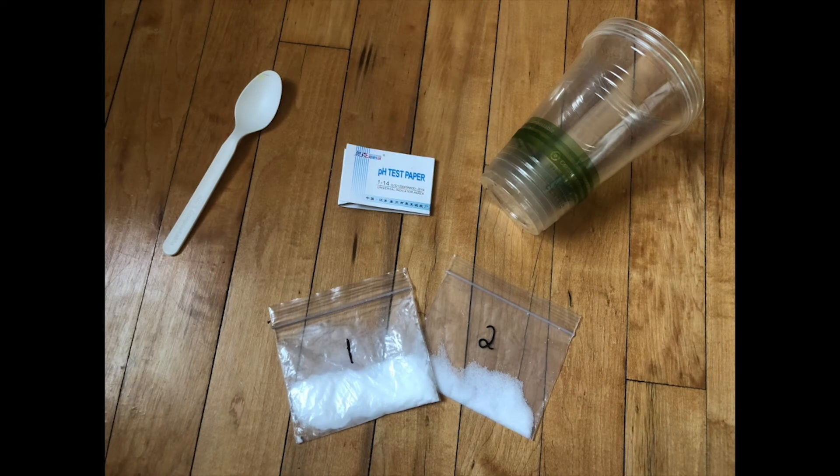The pH of a body of water can have a huge impact on the life that can live there. So let's get started taking our measurements. The supplies you'll need for this activity are three cups, a spoon, pH test strips, and your two baggies labeled number one and number two.